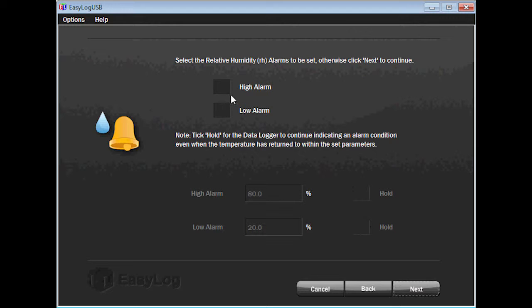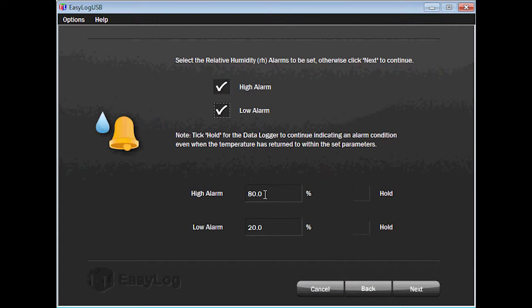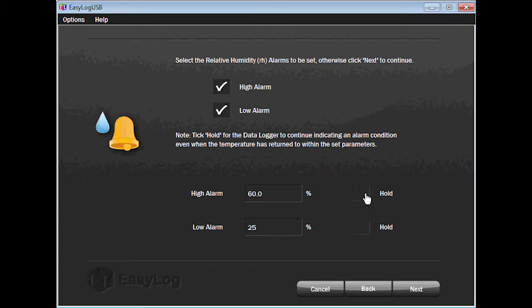Next, select the humidity alarms you would like to set — either high, low, both, or none. I will record both. Now type in the values for the humidity alarms. The maximum percentage for either alarm is 100%. I will make the high alarm 60% and the low 25%. Like the temperature alarms, I can also choose to check the hold box if I wish the data logger to report there was an alarm condition even after the humidity has returned to within the set parameters. Click on Next to continue.